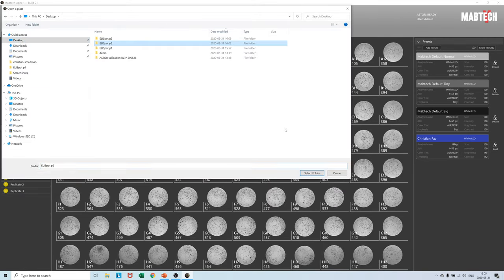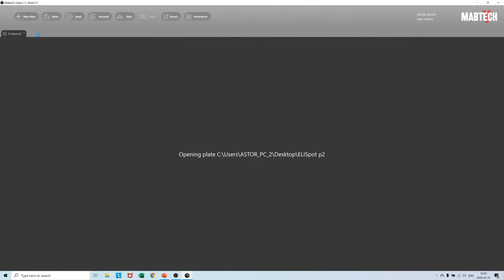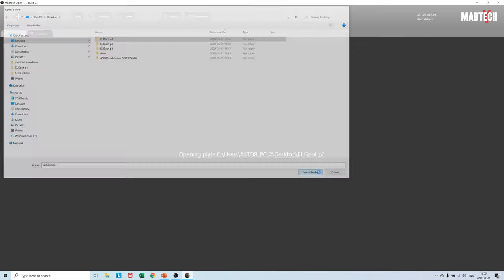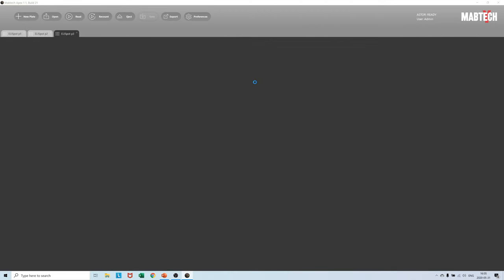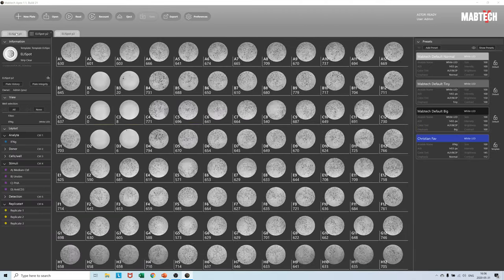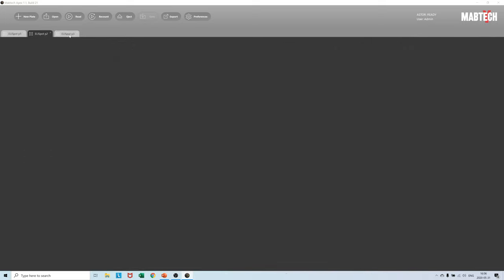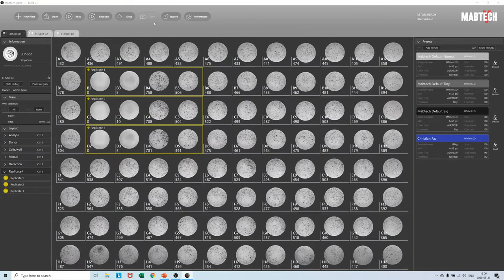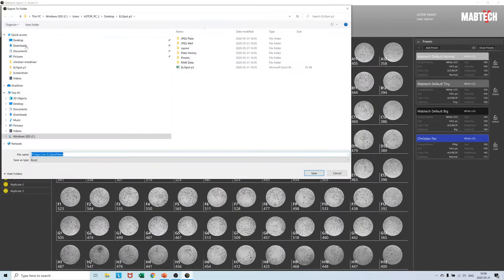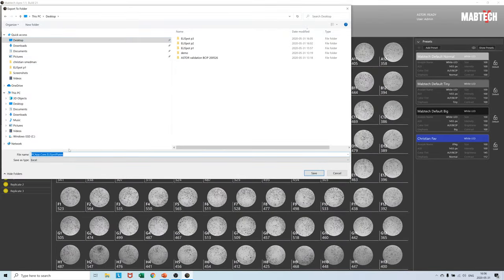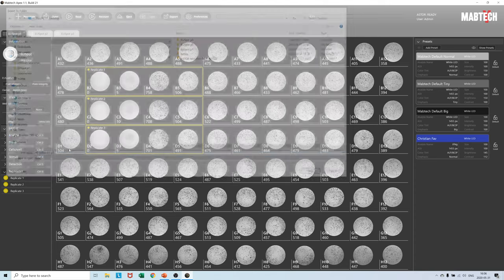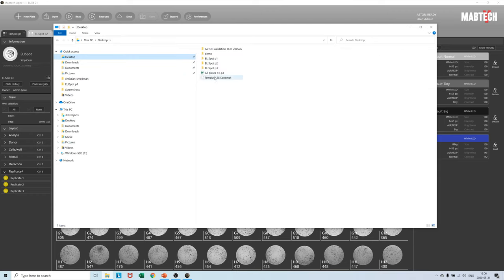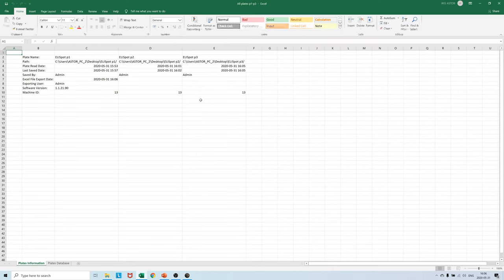With the three plates saved safely on the hard drive we can now take advantage of the great export functionality in Mabtech Apex. Load in the three plates simultaneously, press the export button, and select all open plates Excel. A combined database for all the three plates can now be saved on the hard drive. Open it up, select all, and insert a pivot table.